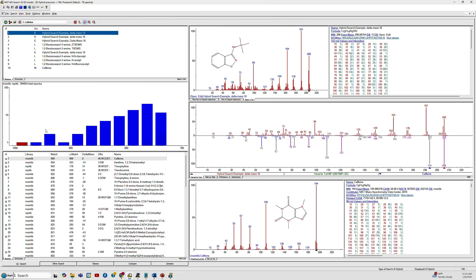The NIST Hybrid Library Search is a powerful tool for unknown identifications in both GCMS and LCMS analyses. Today I will demonstrate the GCMS analyses in EI mode.